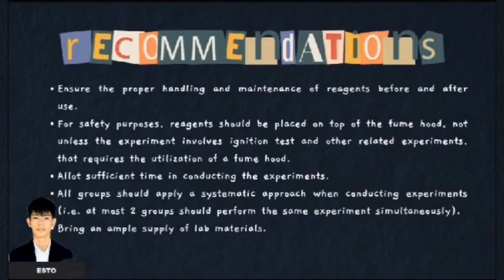Here are as follows. Ensure the proper handling and maintenance of reagents before and after use. For safety purposes, reagents should be placed on top of the fume hood, unless the experiment involves ignition tests and other related experiments that require the utilization of a fume hood.